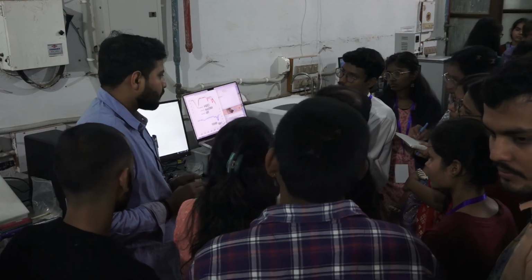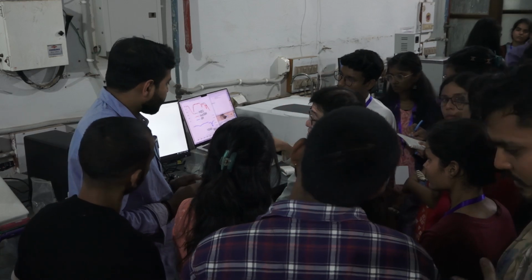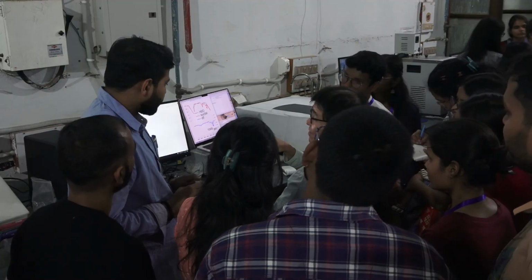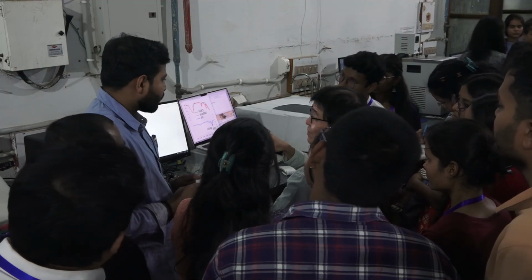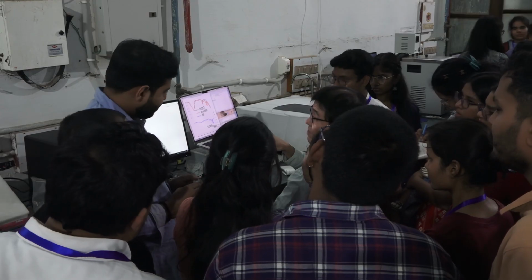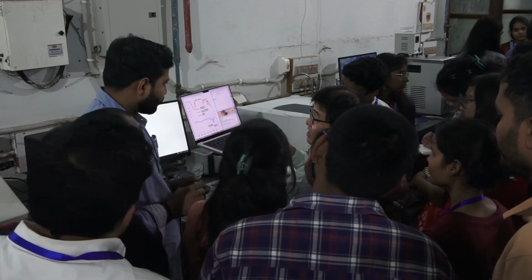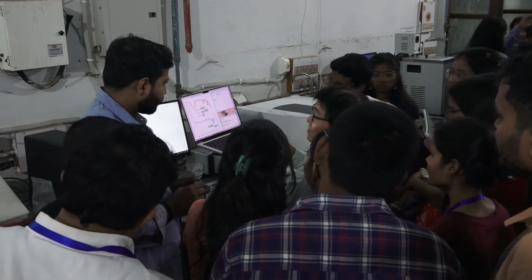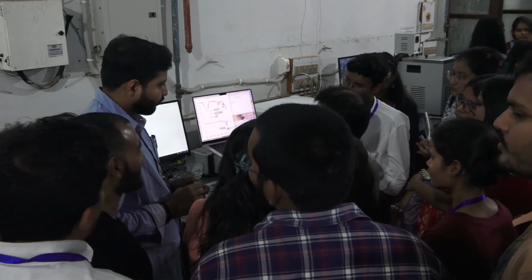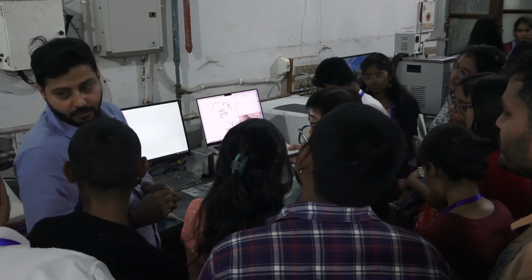Ideally, if there is no solvent-solute interaction, this peak does not change, and only the signal of sucrose should appear on the blue spectrum. But the solvent is also affected by sucrose, so there is a peak shift or change. So this is a measurement of the sugar spectrum, the sucrose spectrum.